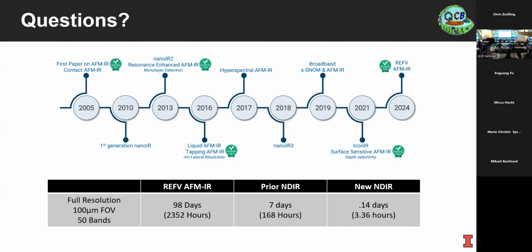The third one is computational tomography, which is essentially what he's doing right now, in that the fields extend into the sample. There's a 20 nanometer region that's really hot that produces the majority of the signal. So they go a little deeper. At different pulsing frequencies of the laser, that heats the sample and then that thermally diffuses.